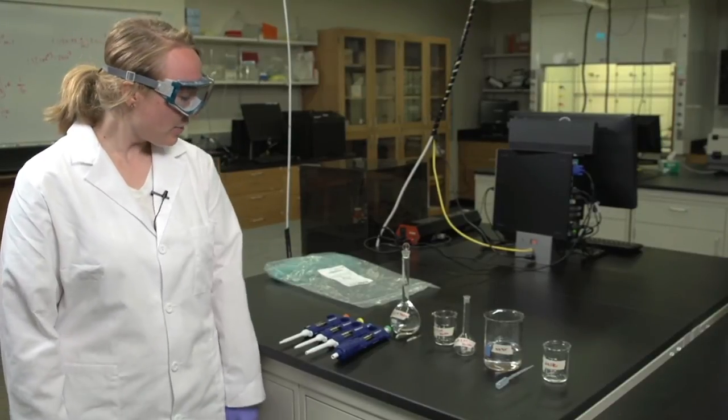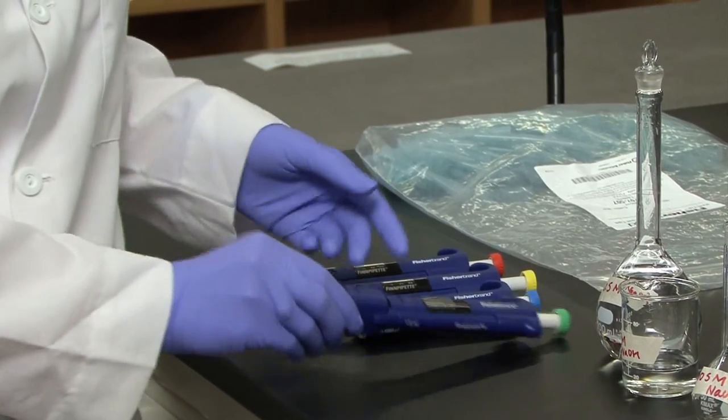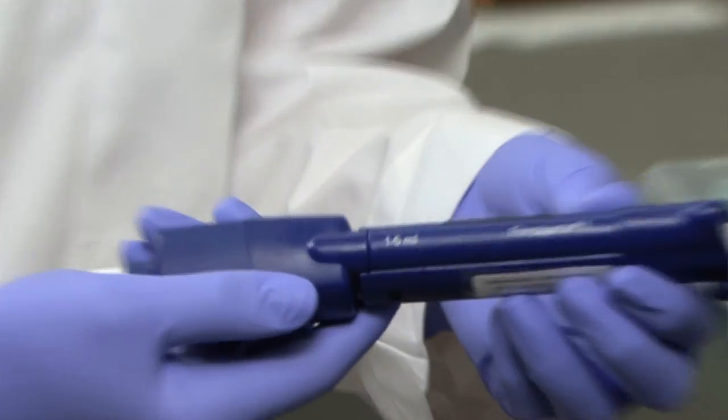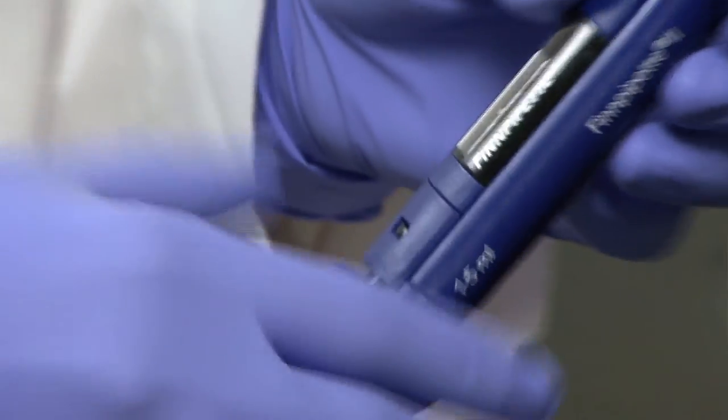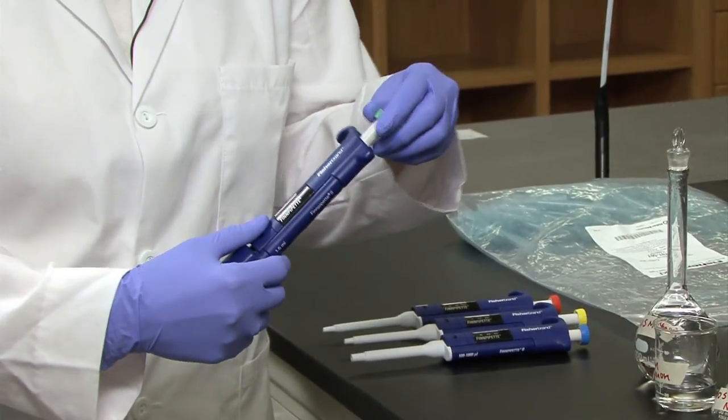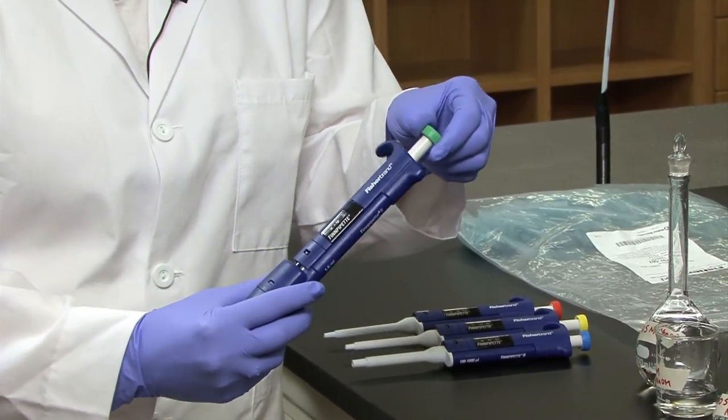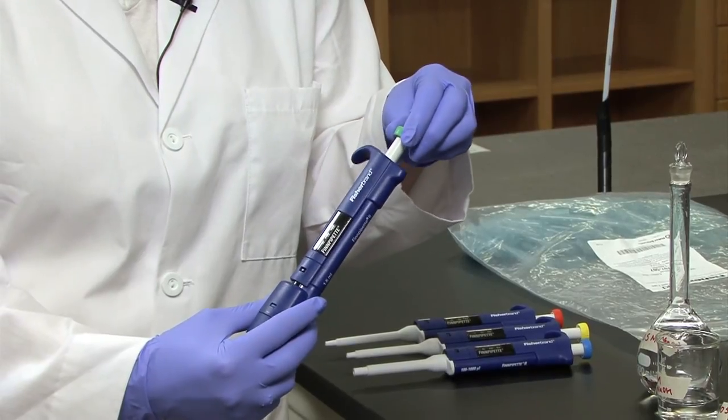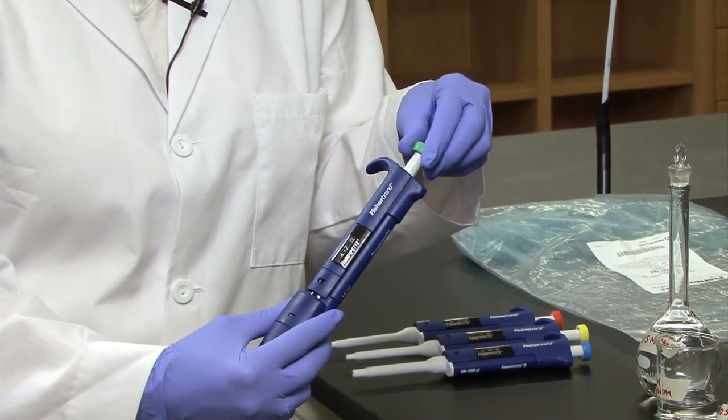Today I am going to demonstrate how to use a micropipette. These are the micropipettes. We have got a lot of different sizes. This one is the 1 to 5 milliliter micropipette. Note that you can change the dial in increments of 5 by twisting this knob on the top.